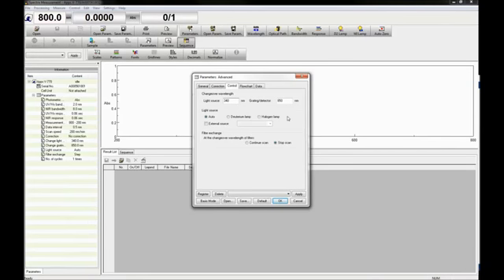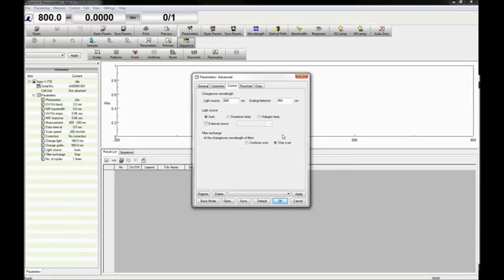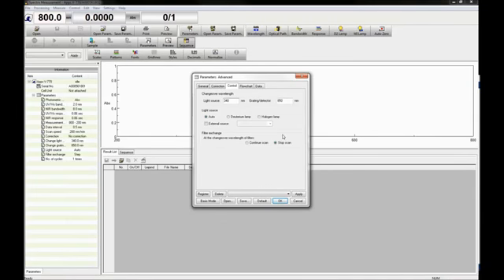You can also specify if you wish to use only the D2 or halogen lamp or choose an external light source. The filter exchange option determines whether the wavelength scan is paused at the filter exchange wavelength. When the filter is changed without pausing, the measurement time is shortened, but noise may appear at the filter changeover wavelength.